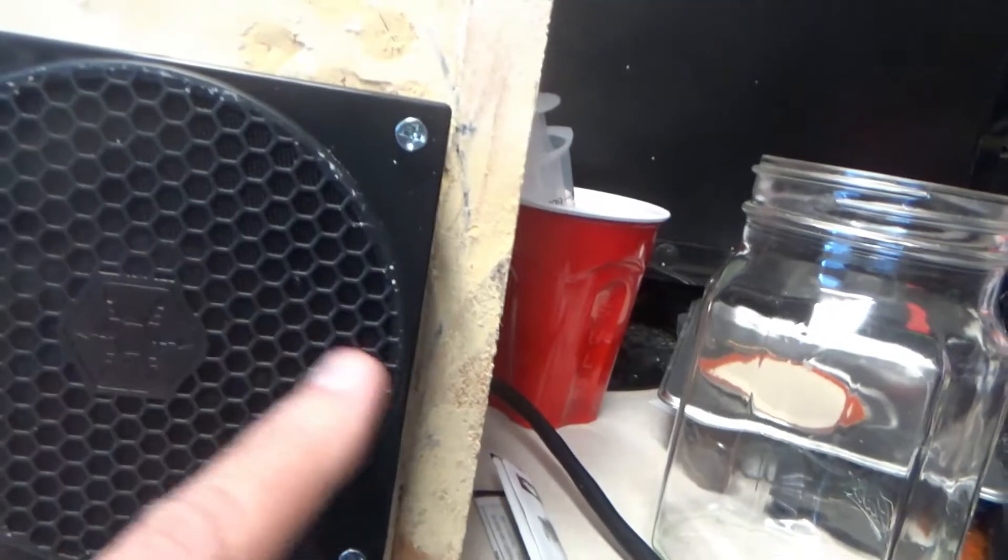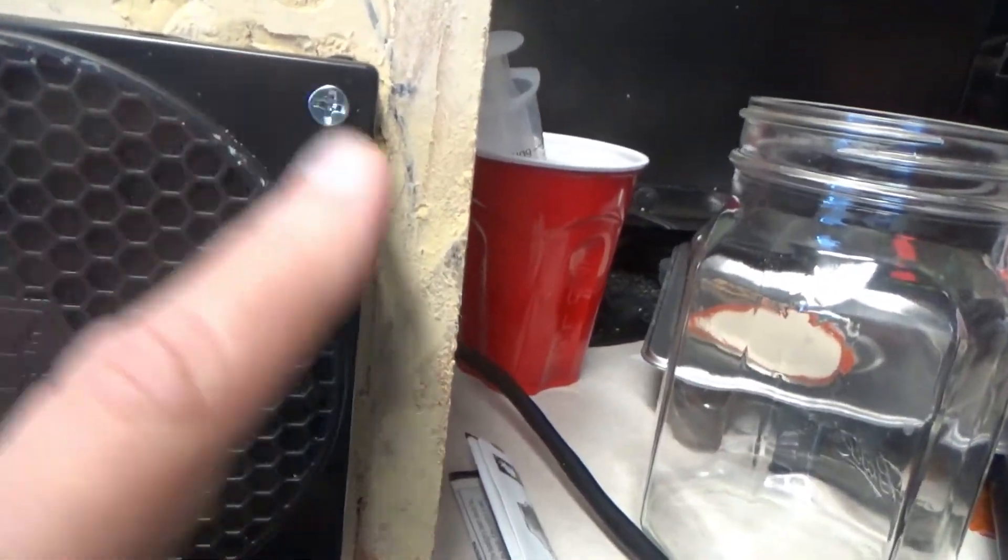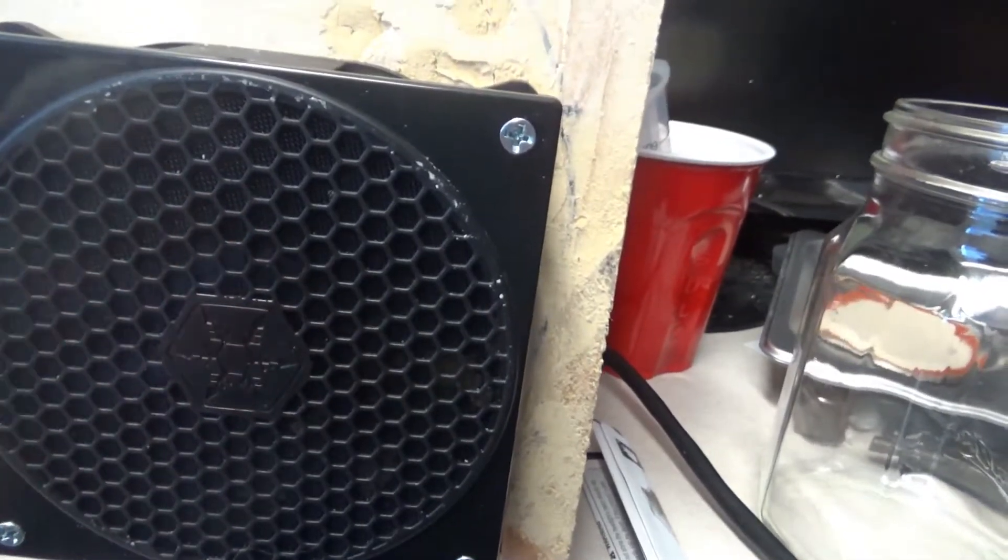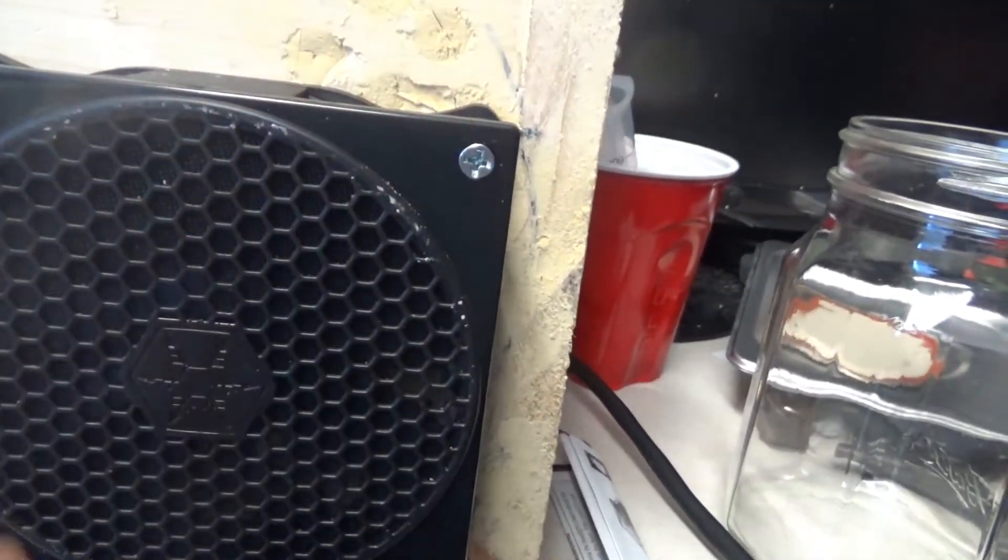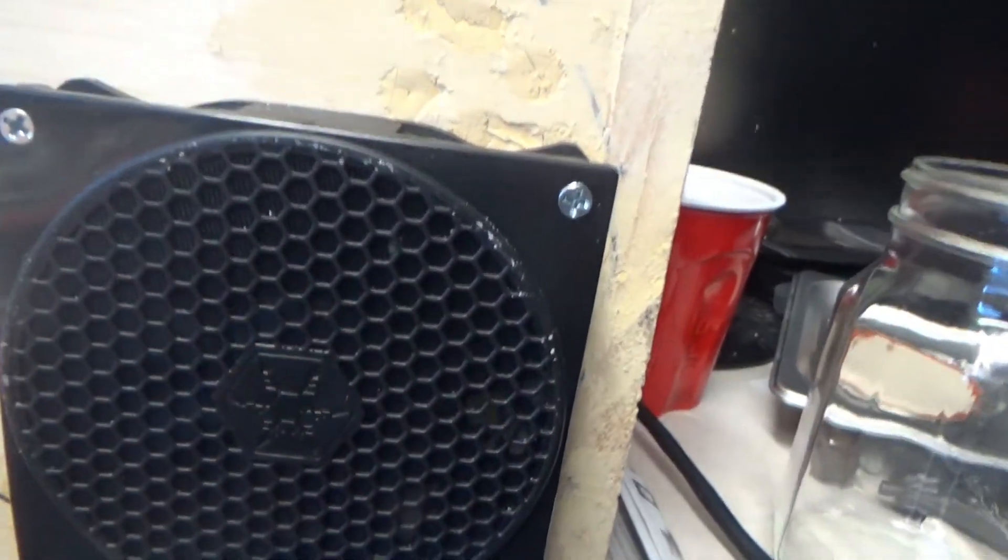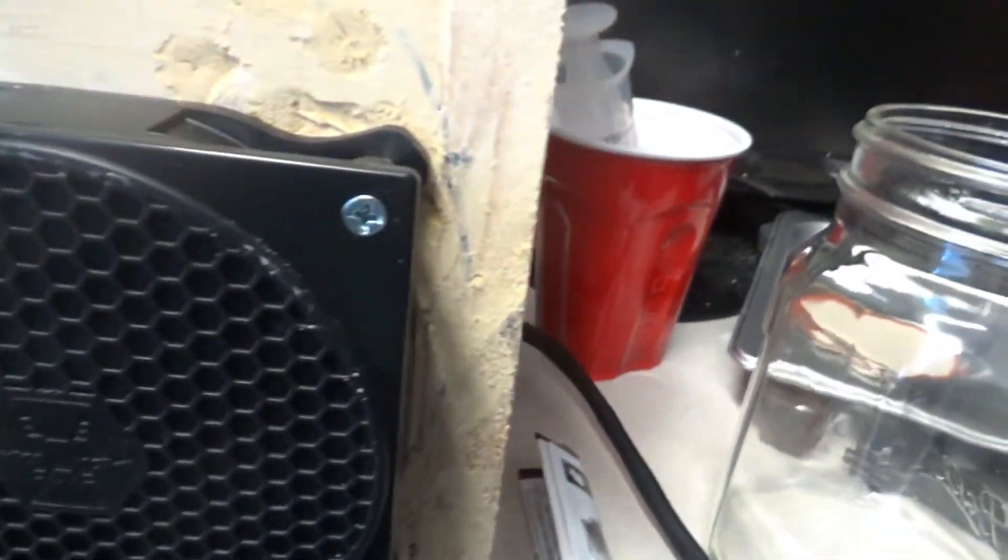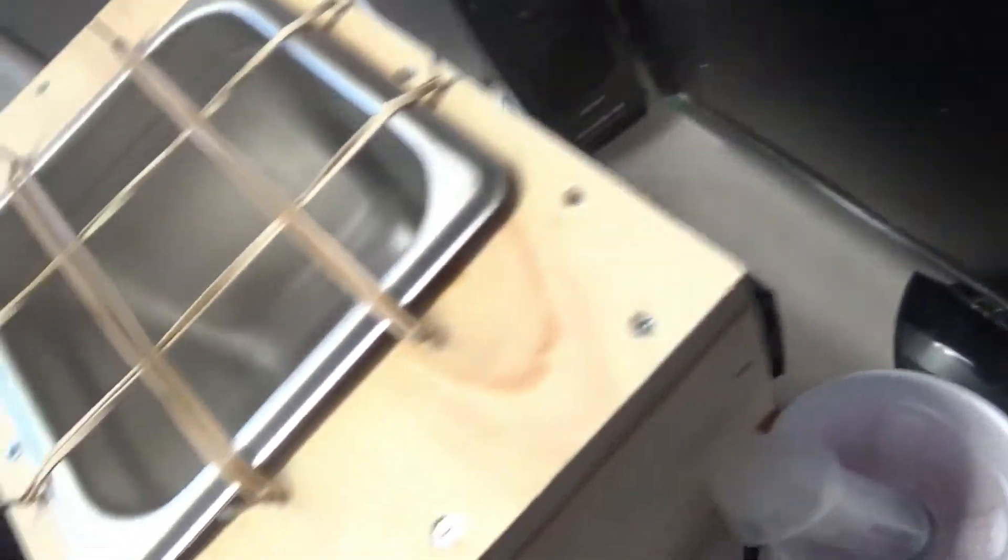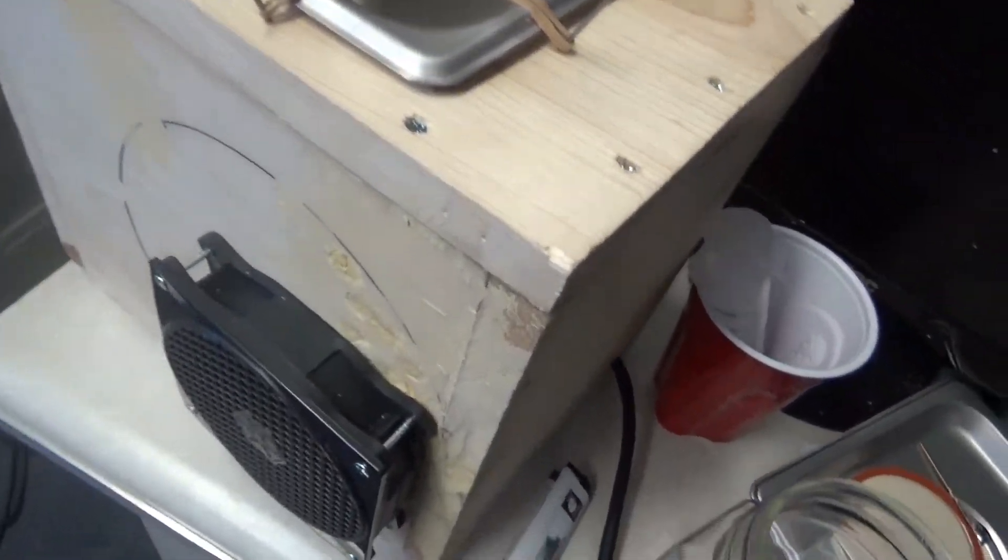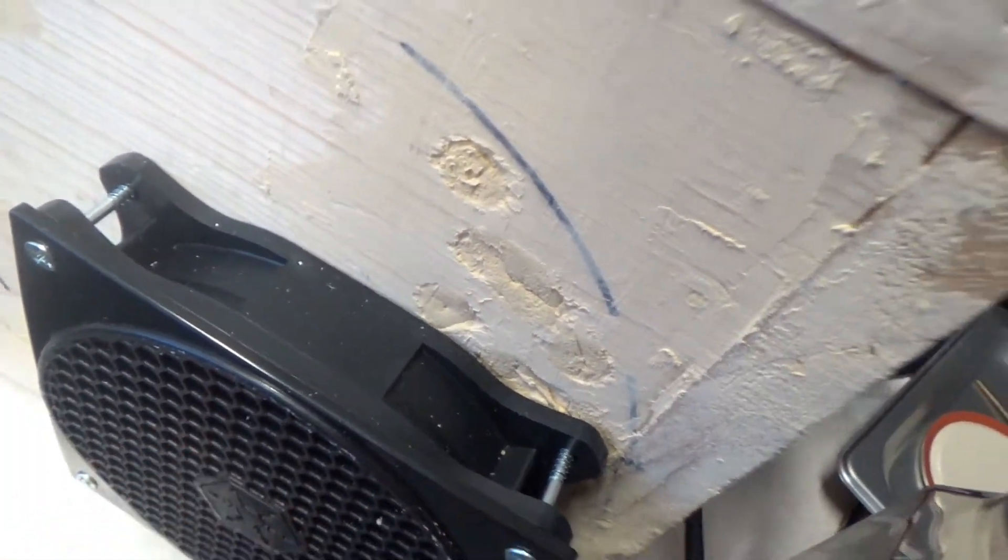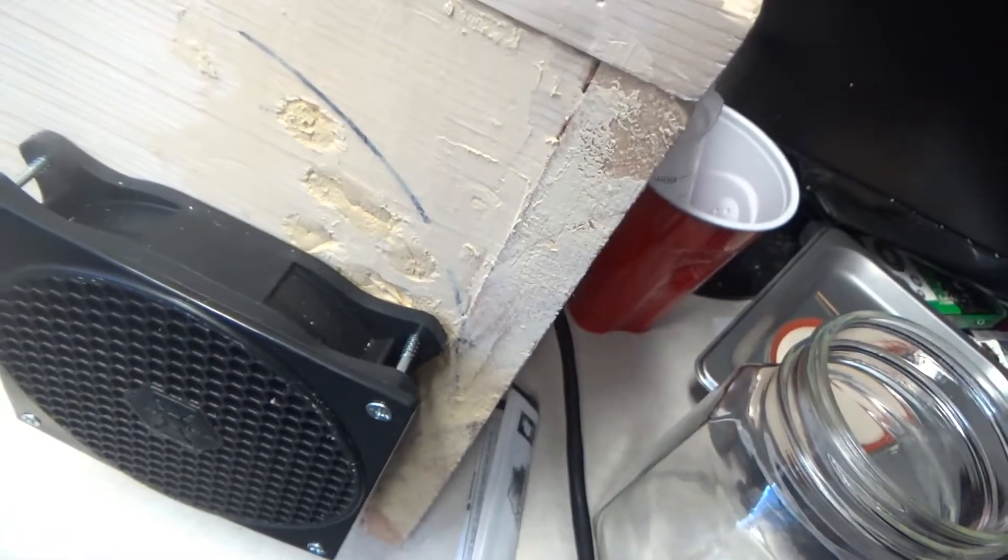So I went to a smaller fan rated at basically the same cubic feet per minute, and I have a big hole underneath here. I'm still using a push-pull configuration with two of the smaller fans. And because it's a smaller fan, I was able to get a shield, so now there's nothing where little fingers can get in there. It's a safer unit.